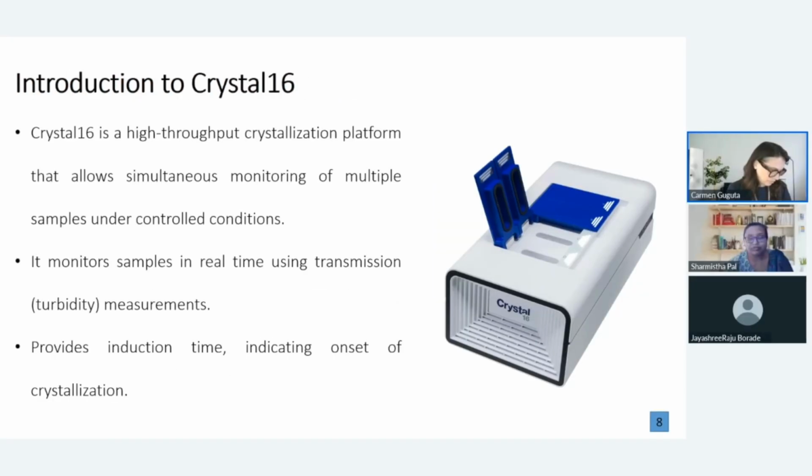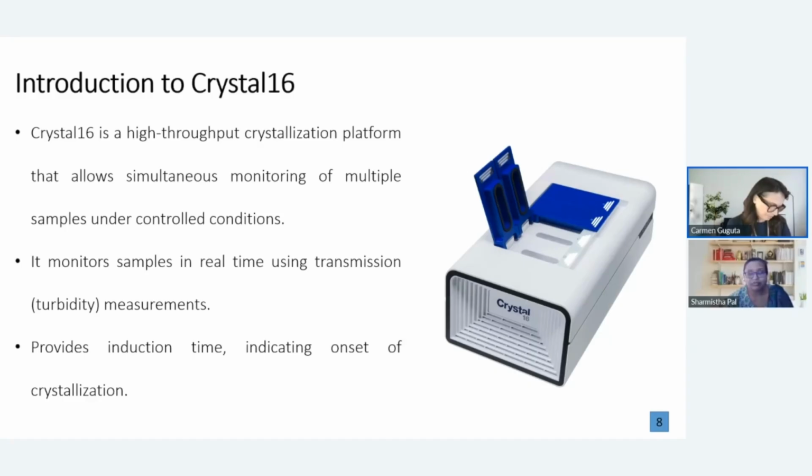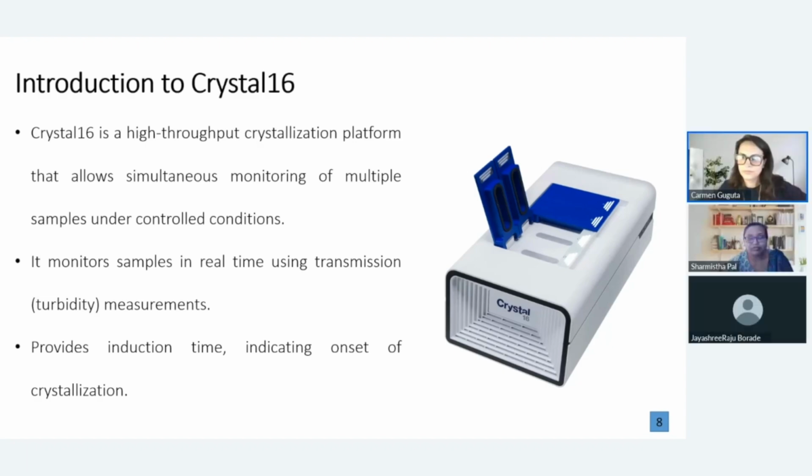Thank you, ma'am, for explaining the fundamental concepts of supersaturation and the limit of congruency related to the amorphous solid dispersion. Building on that, I will now take you through the experimental approach and how we determine the critical concentration of polymer using the Crystal16.